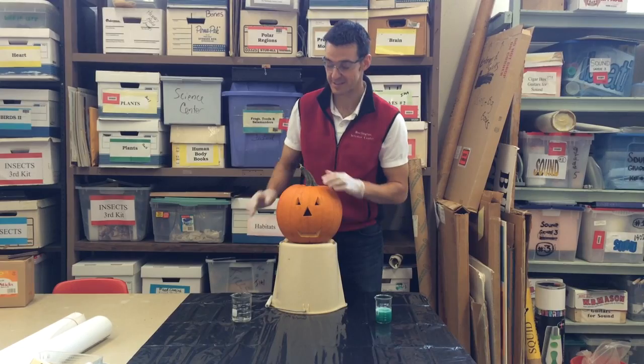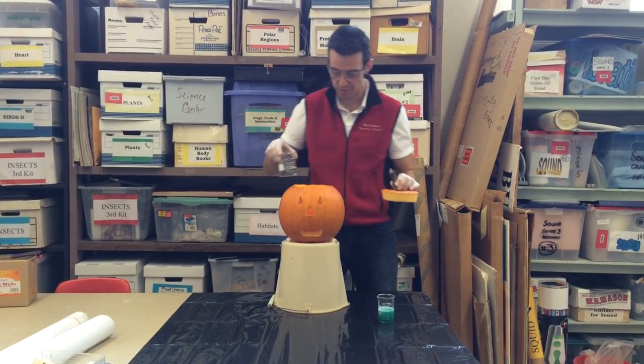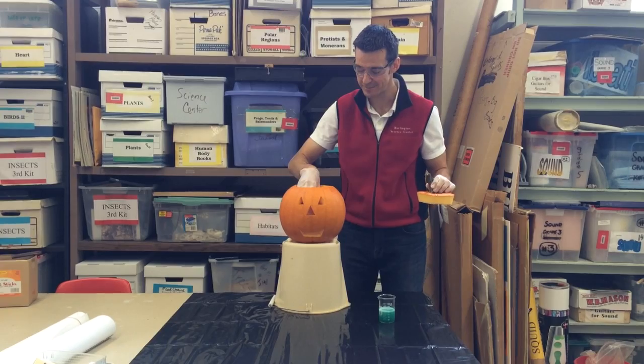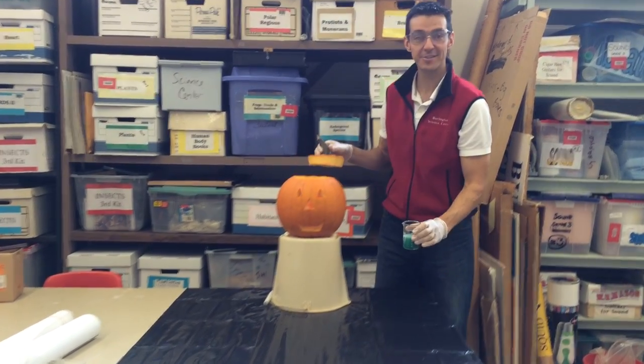So I'm hoping this works exactly how as I planned it, and I hope you enjoy it, and have a happy Halloween. Are you ready? Here goes nothing.